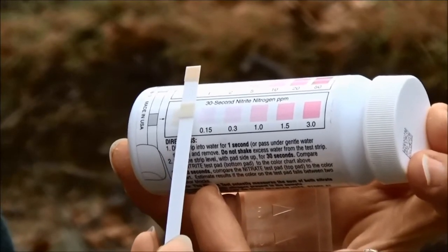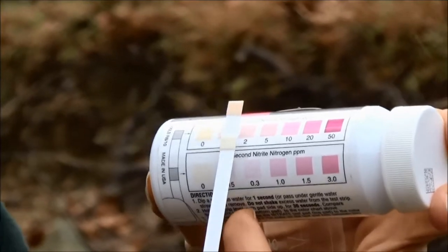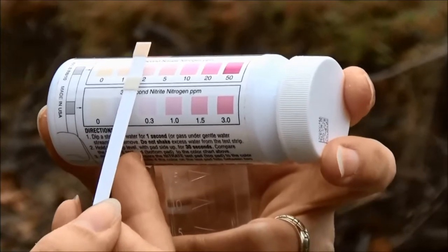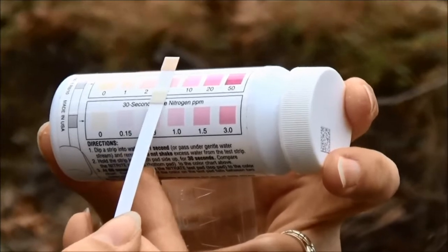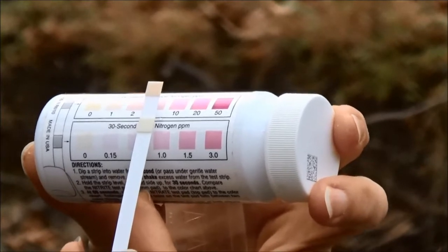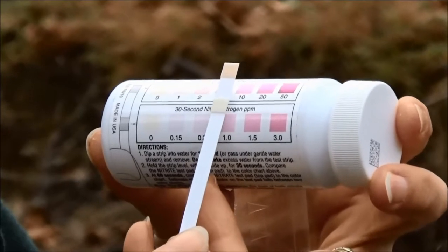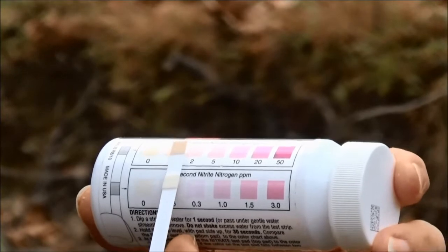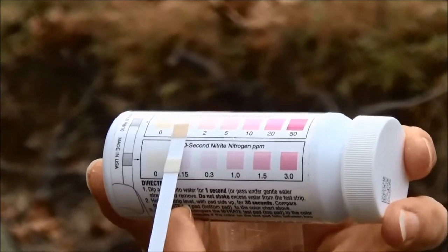It looks like we have zero for the nitrite, and we're still waiting for the nitrate. These are both forms of nitrogen, which is a very common pollutant. It can come from things like fertilizers, sewage, or any kind of organic matter. If you have too much nitrogen in your stream it can cause a lot of algae to grow, and when that algae dies it decomposes and uses up all the oxygen. At 60 seconds we have a reading of 1 part per million for our nitrate.